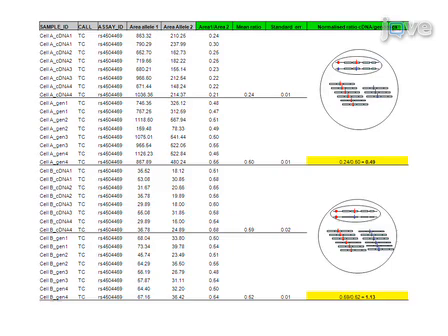The software will calculate the area underneath each spectrum peak, which represents the abundance of each of the 2 alleles. The allele ratio is calculated by dividing the area of allele 1 by the area of allele 2. For each cDNA and genomic sample, a mean and standard error are calculated across the 8 measurements. A high standard error, greater than 0.1, indicates that measurements are not consistent and should be disregarded.